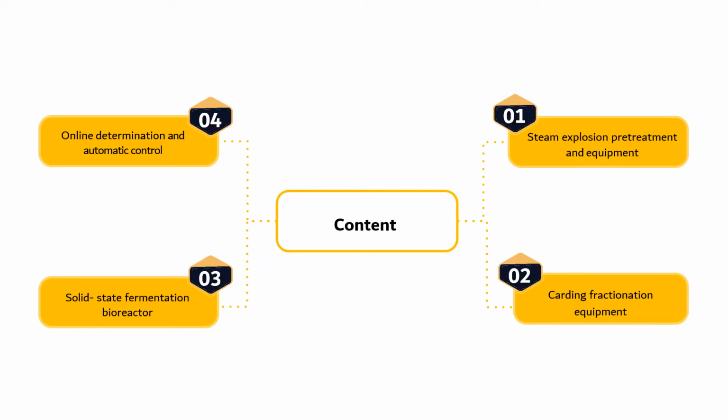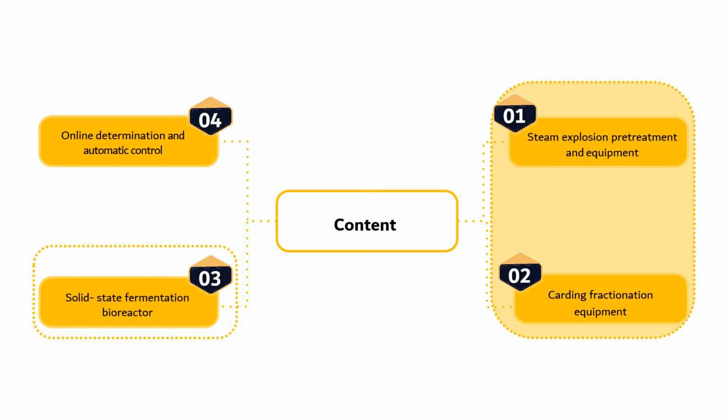We have previously discussed steam explosion pre-treatment and equipment, as well as carding fractionation equipment. In this segment, we will discuss solid-state fermentation and the gas double dynamic solid-state fermentation bioreactor.